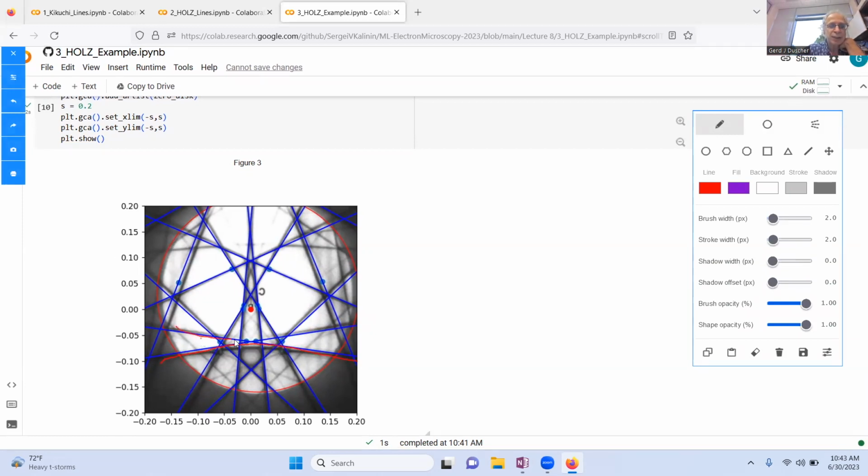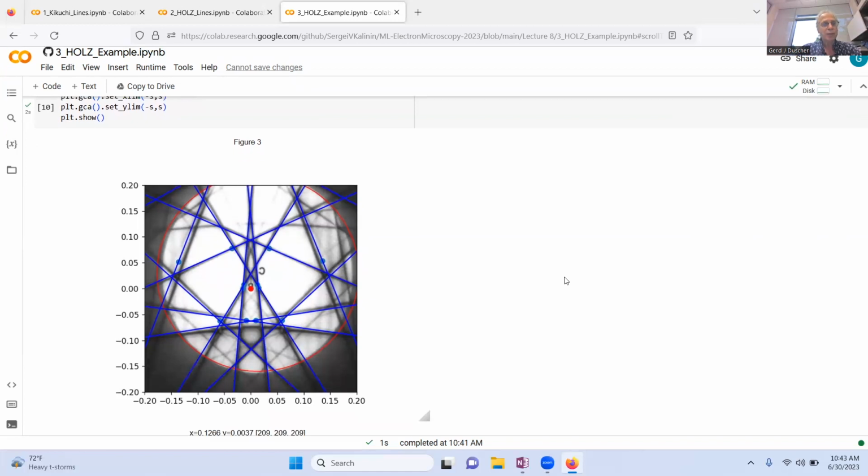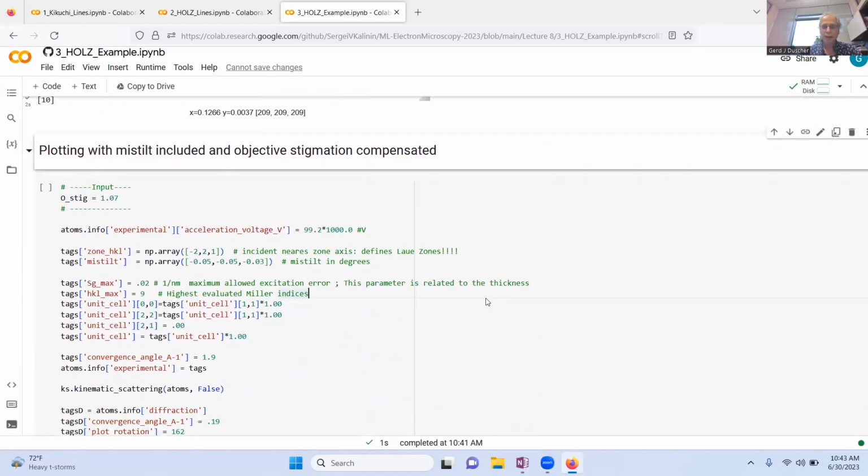These lines are actually split, and you have some dynamic effects with that. So this can happen, and these kinds of dynamic effects are not avoidable. And since we know about it now, we ignore that part. So let's see how much more accurate we can do that.